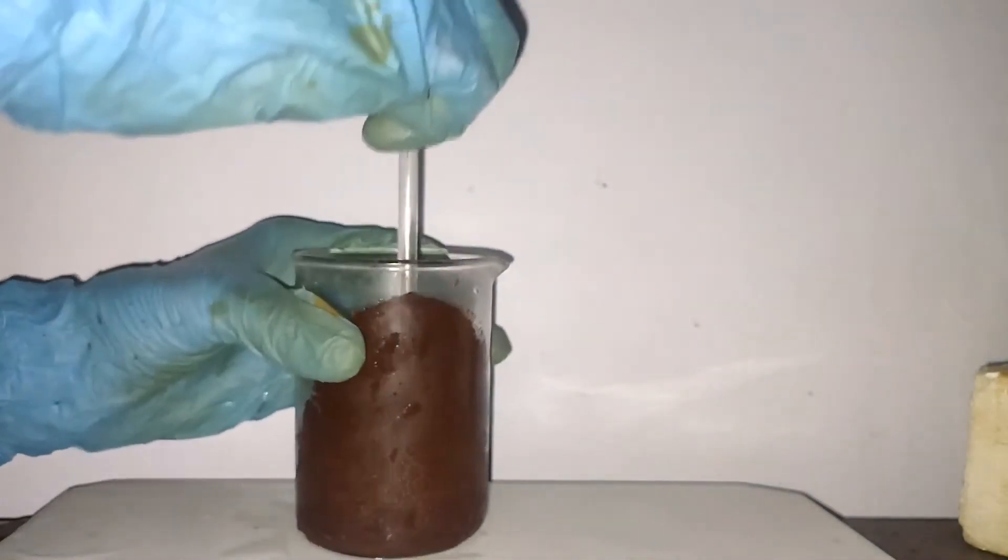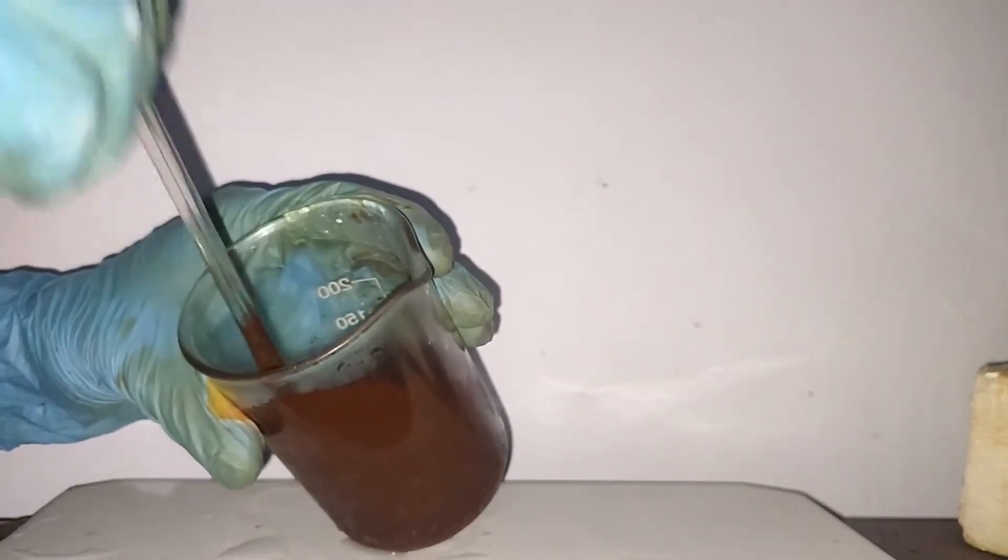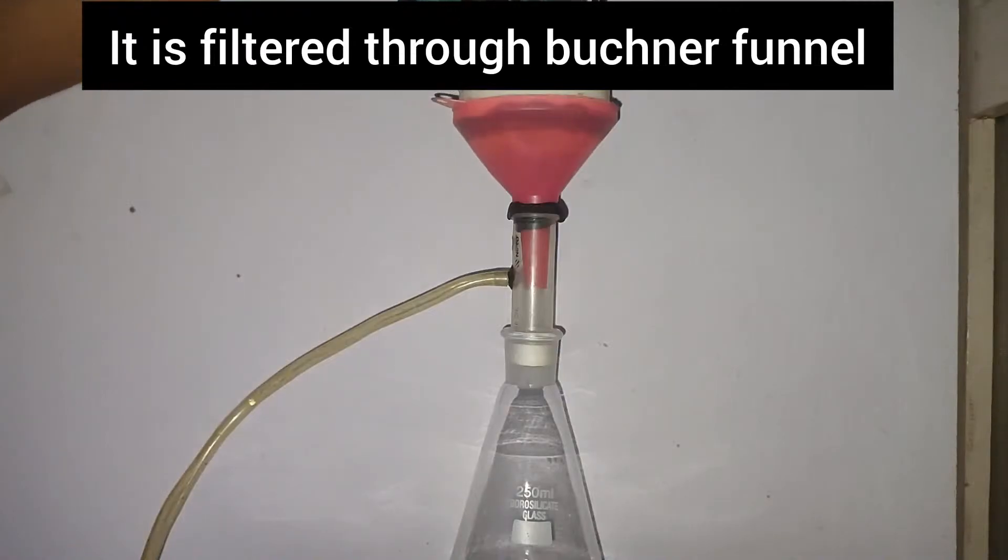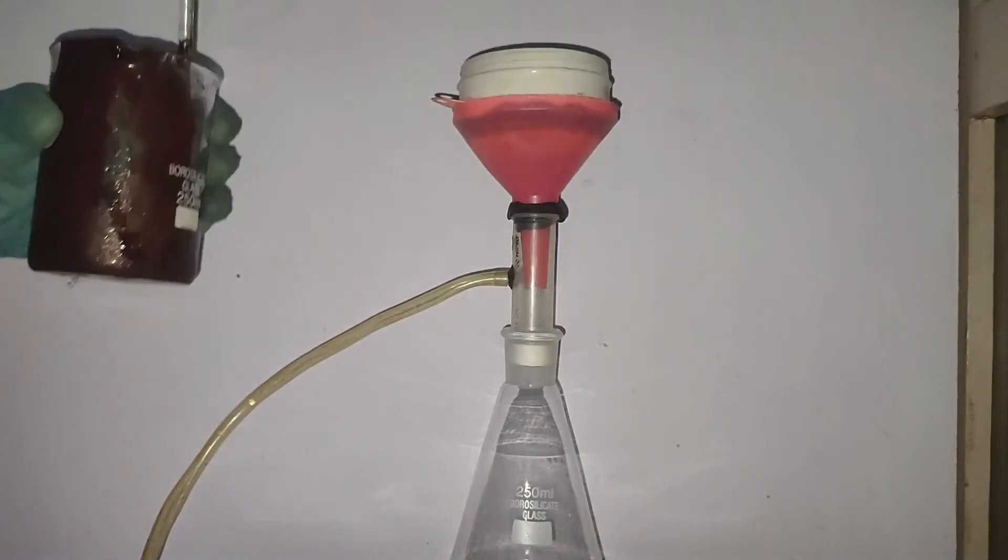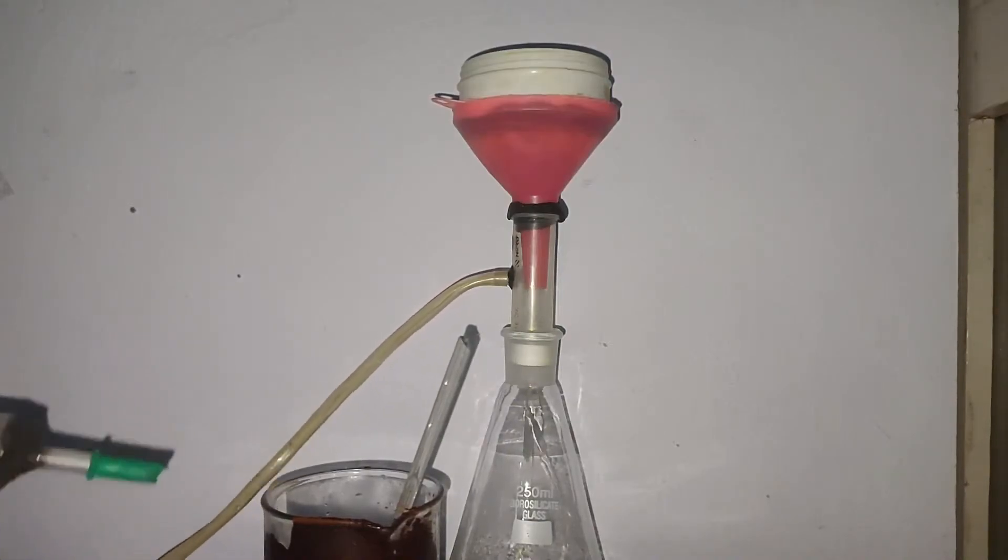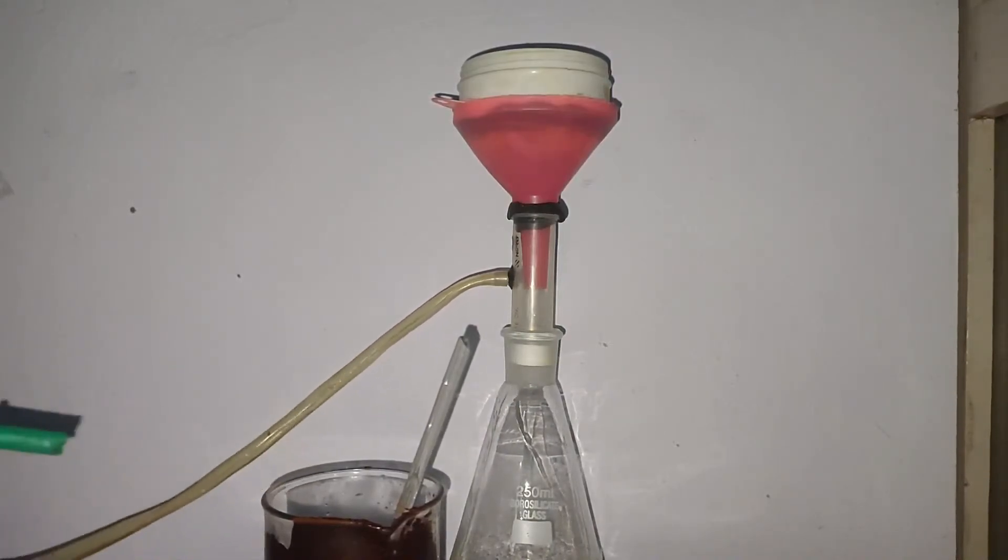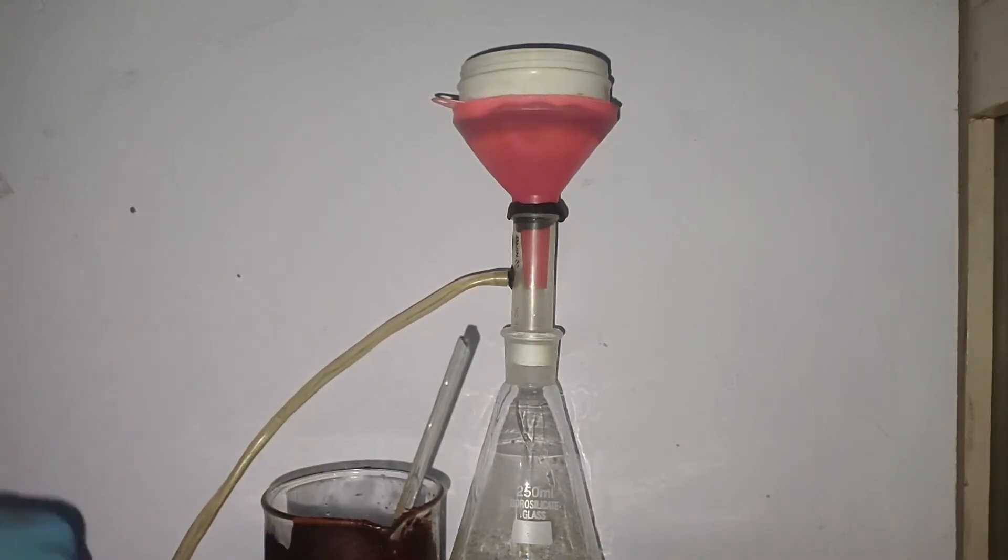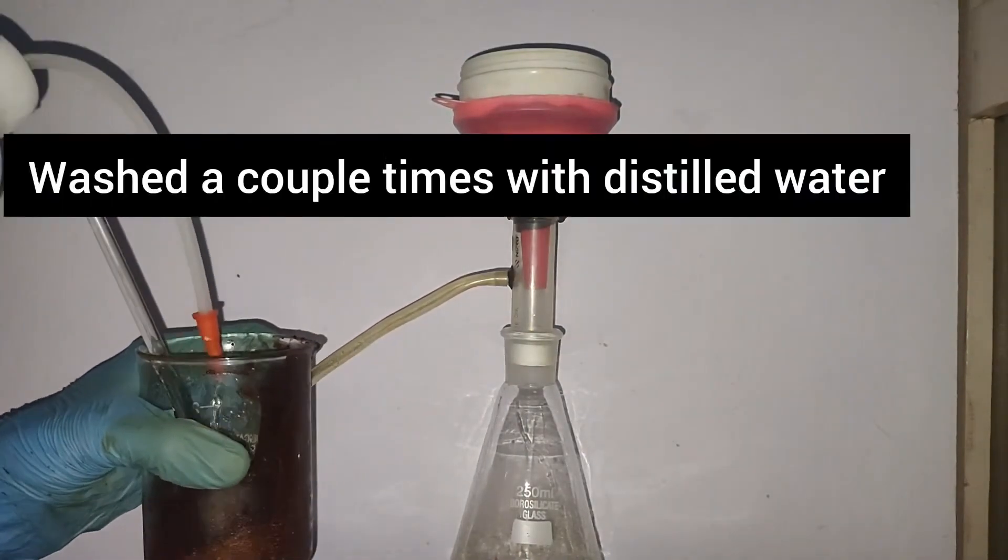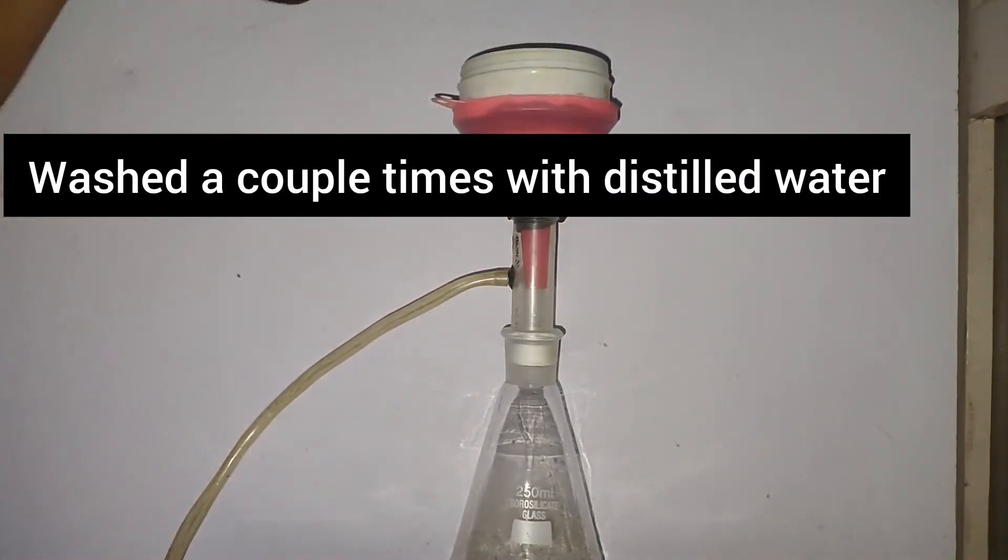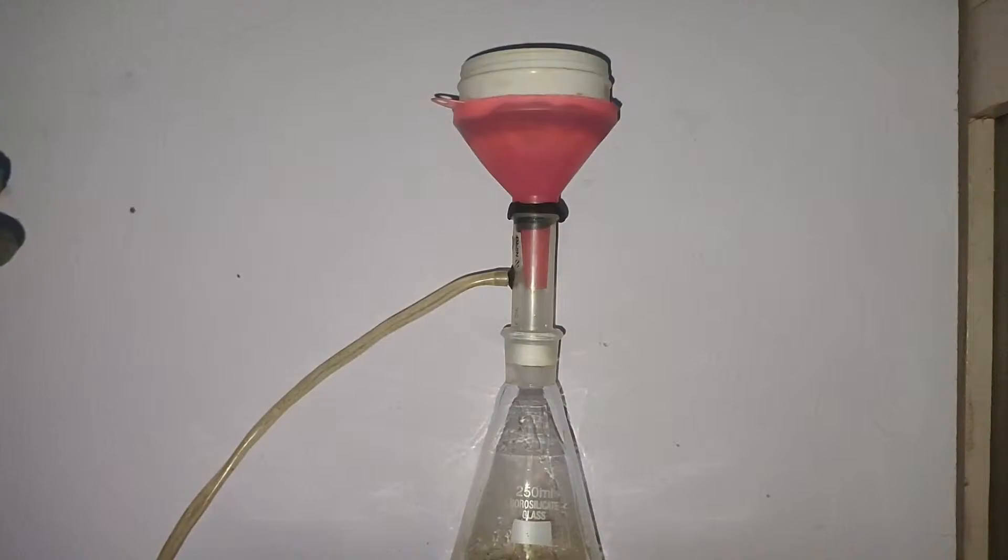This is the dye Magneson 2, which is brown in color. Now this is vacuum filtered through a Buchner funnel. This is my DIY vacuum pump and Buchner funnel. If you want to see, you can click on that eye button which will direct you to the video.